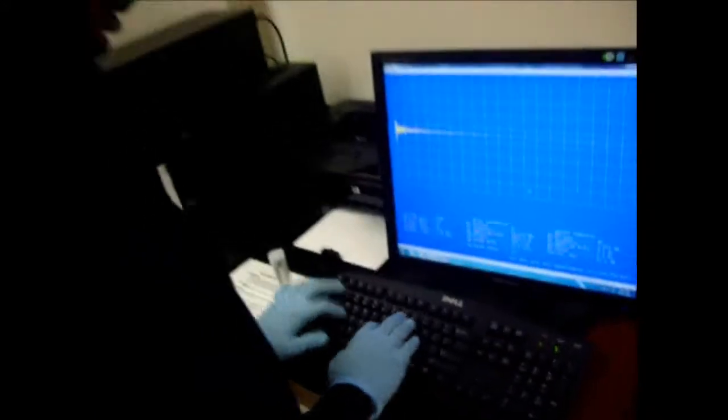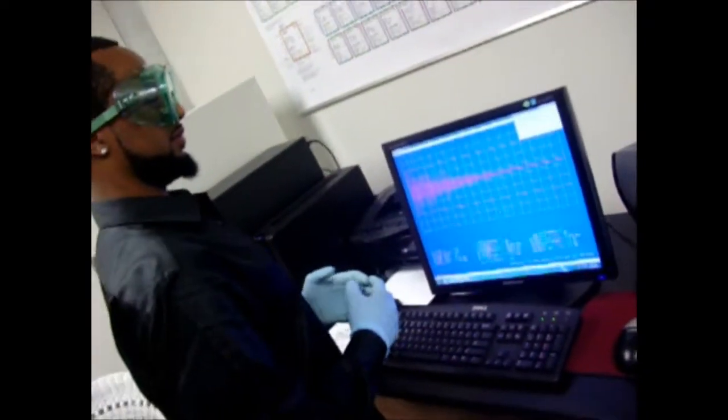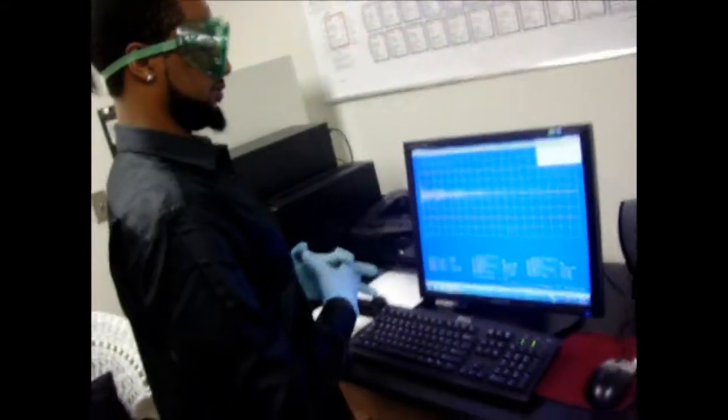Yeah. So shim it. Remember the command? I'll tab first to the other screen. I always make that mistake. So the very first thing to run NMR is shim, enter. And you're going to do 5, 5, enter. And when that box disappears, it's done.